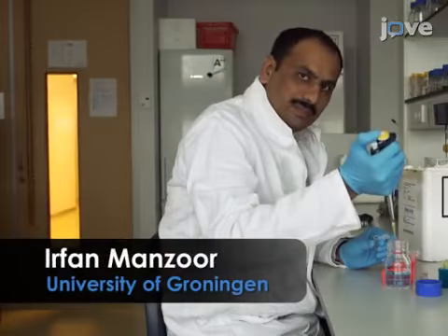Demonstrating the procedure will be Mohammed Afzal and Irfan Manzoor, PhD students from my laboratory in molecular genetics.